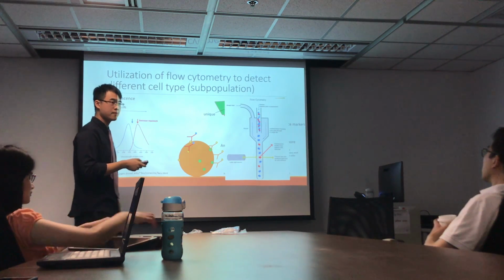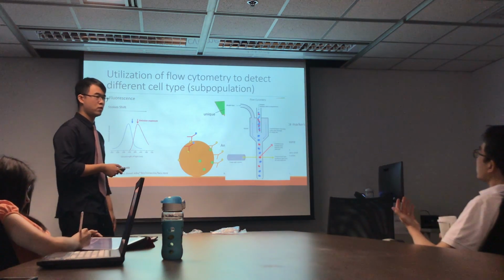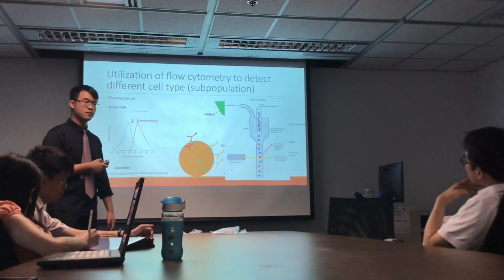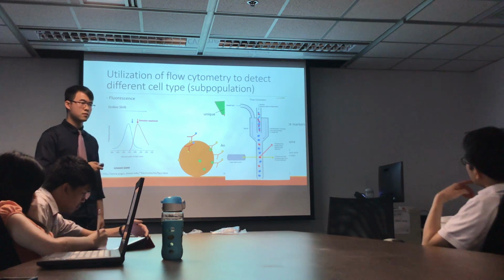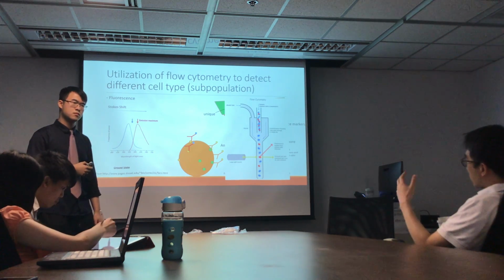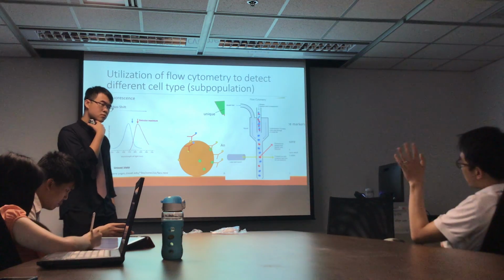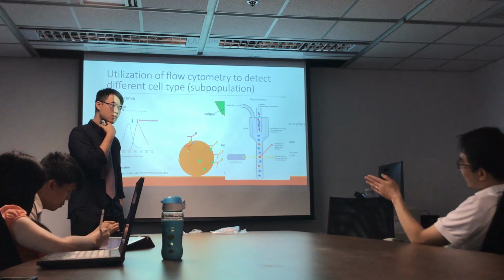But what if you want to use intrinsic fluorescence, not the antibody? For example, in that case, can you sort the cells? You can't see the signal, but I saw a piece of work from Nancy's group. They're doing flow cytometry on amyloid fiber. They have some cells with amyloid fiber, A beta fiber, and some cells that don't. The fluorescent dye is something similar to Congo red, but it's a fluorescent dye. Then you just use this technique to sort the cells with and without signal.